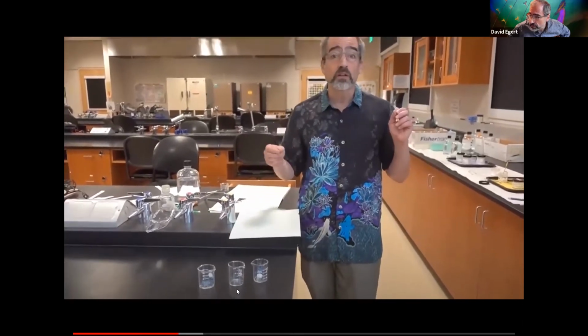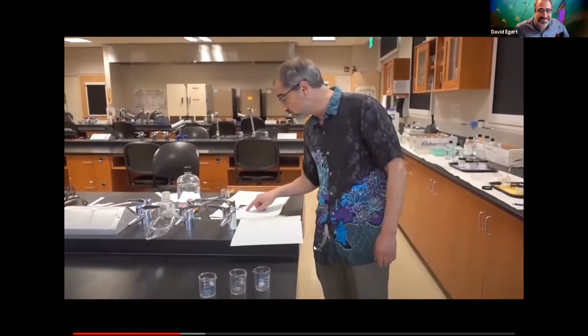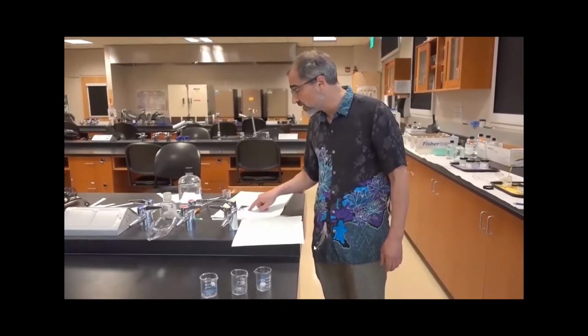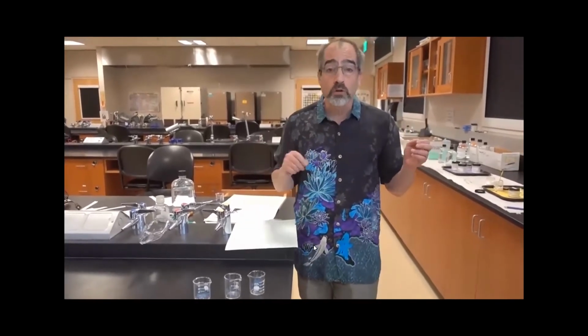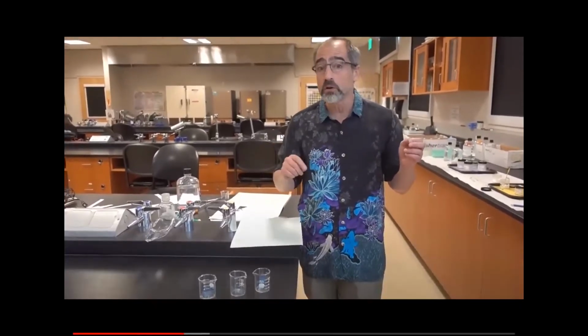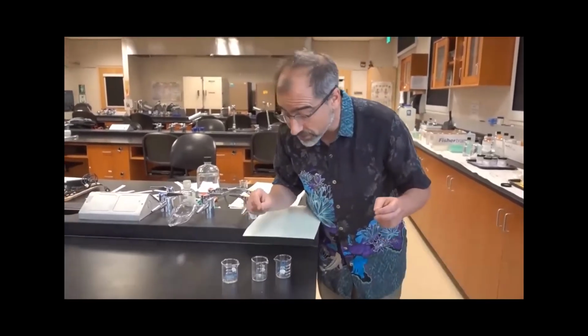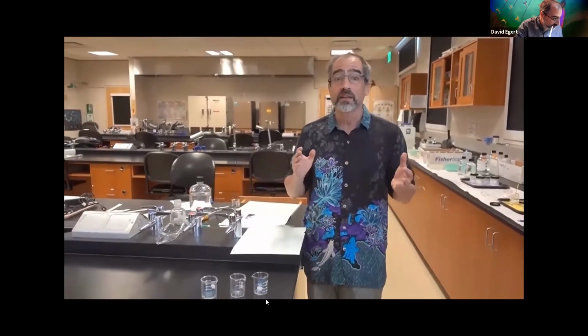And this is where you're writing things in your lab book. When it says the appearance of the dry electrolytes, you actually want to record that in your lab notebook. Use your pen and write down the words that describe it: granular, white, fluffy, whatever words. This is a qualitative description, so there's no right answer other than it should reflect what your observation is. And it needs to be something that you record while you're actually experiencing it.